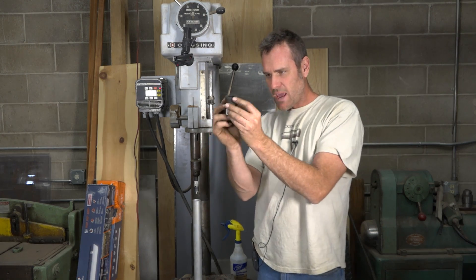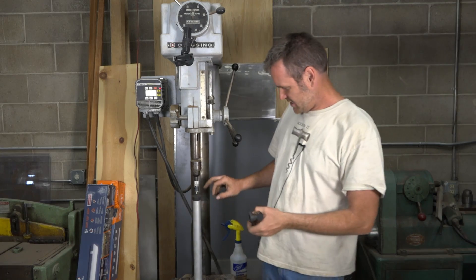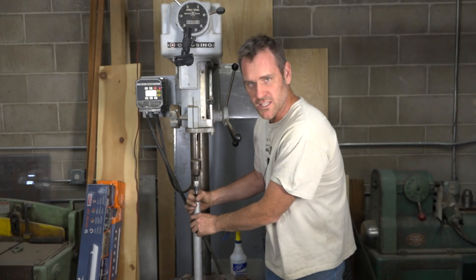The cool thing is since these stoppers are tapered, as you start really cutting into it, it's actually going to get tighter in the tube and hold itself still.